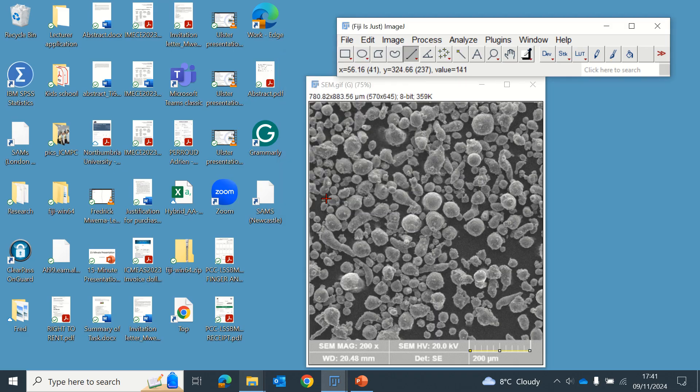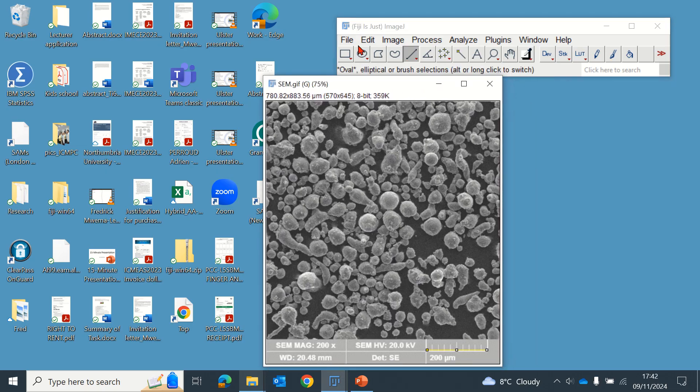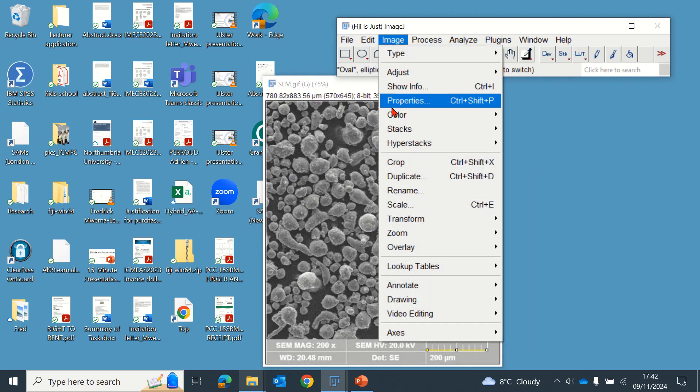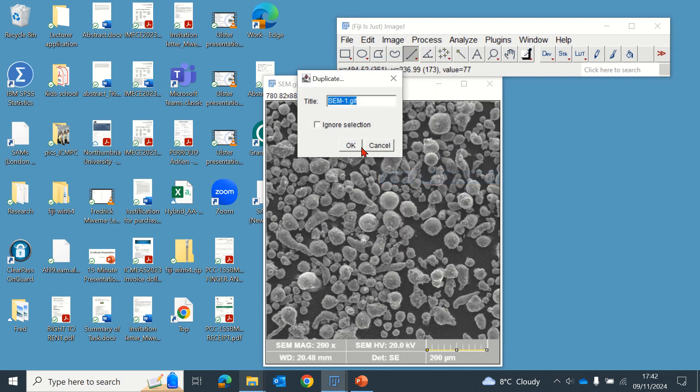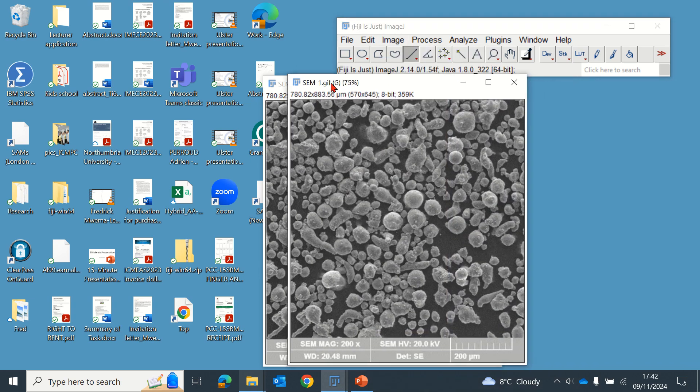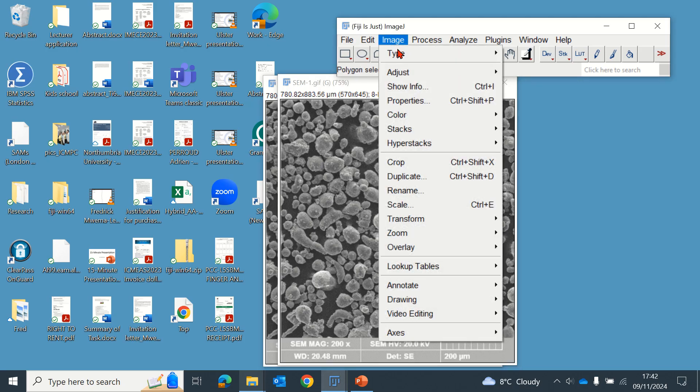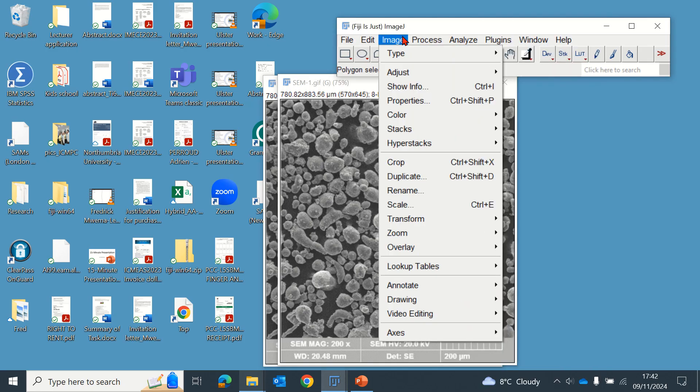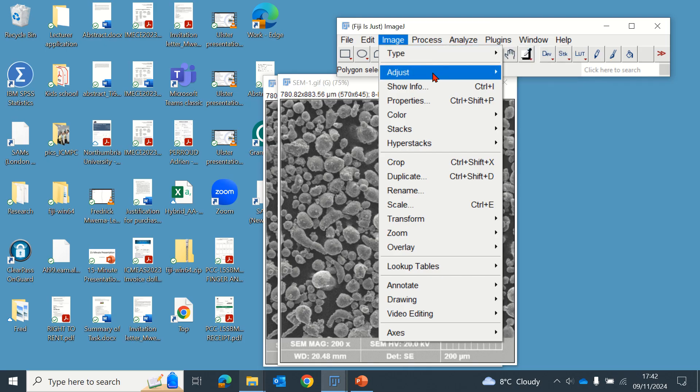Next, I like duplicating the image so that we don't change the original one. If we make a mistake, we can still go back. The next step is to ensure the image is 8-bit.